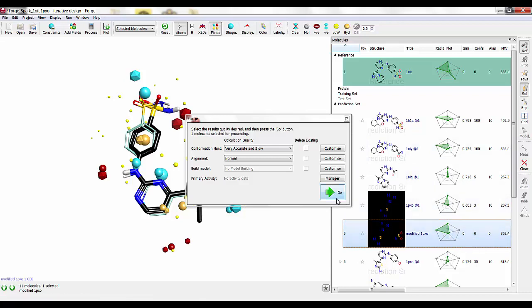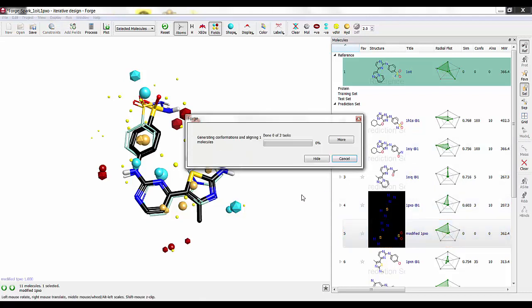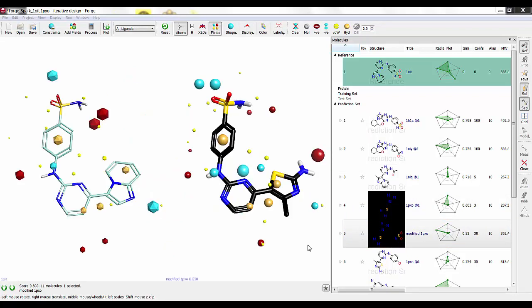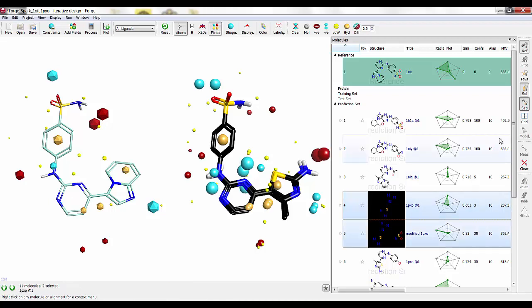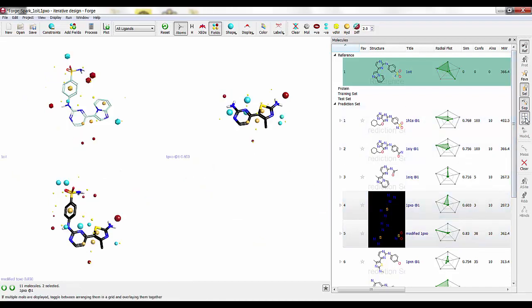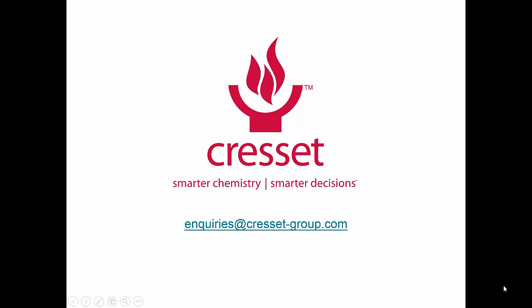Let's go ahead and do this. It'll just take a moment. Now that the alignment of our modified 1PXO is finished, we now see that we have an alignment score of 0.83, which is substantially better than the 0.6063 that we had with our fragment. We can overlay those and look at those in a grid together.